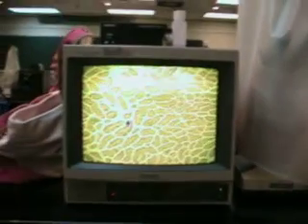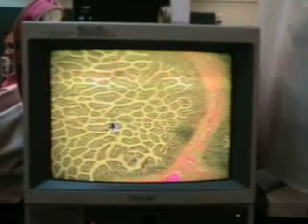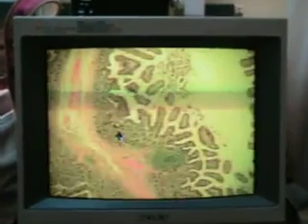Oh, beautiful. Beautiful. All right, so if you look at this, that's like leopard print. I like that. This is the plica, right? This big plica, and then there are the villi, and here you see the villus actually from the bottom to the tip. This is the lumen with some debris in it. Okay, so over here, those are all the villi.